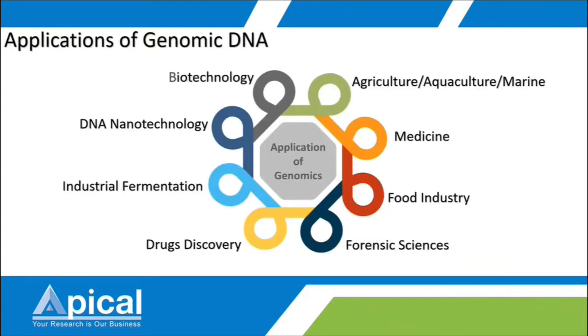Okay, so basically, genomic DNA plays an important role in most biological research or molecular biological study. You can say that it is the starting material for a study. I will not go through every application here, but just an example in biotech. For example, genomic DNA is important, especially in molecular biotech applications like cloning, genome editing, study of the whole genome, and study of gene expression.